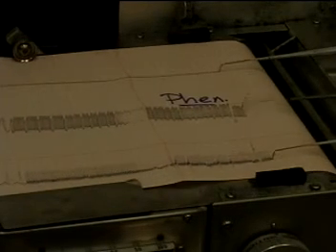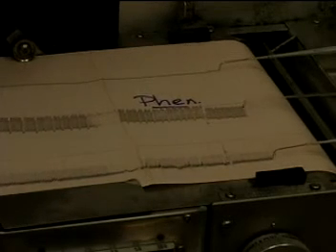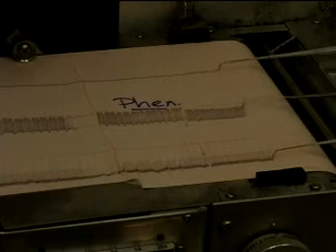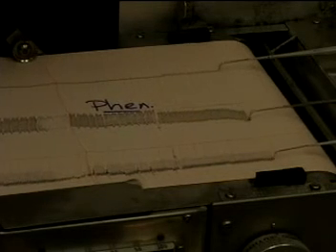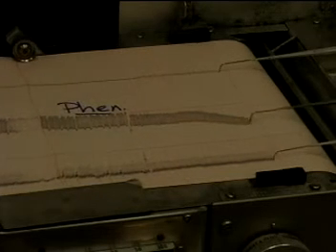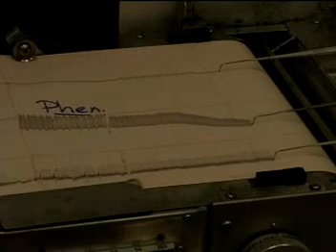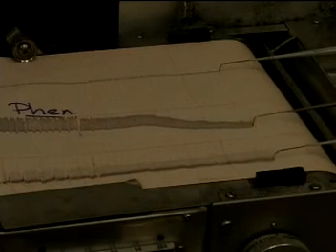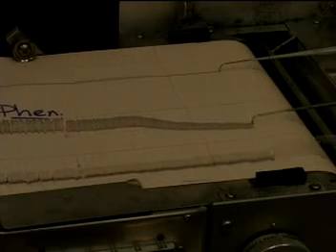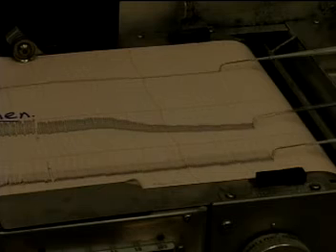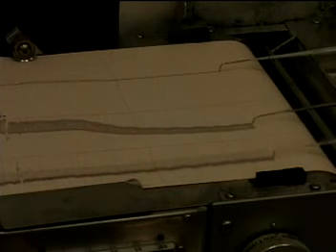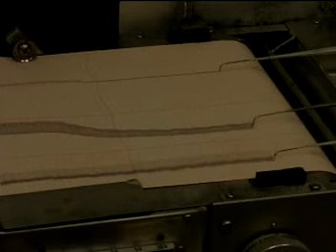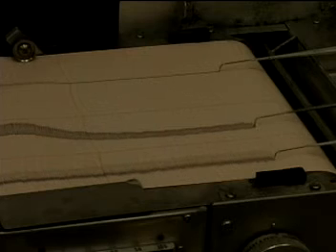We're now injecting phentolamine, the alpha receptor blocker. Because the sympathetic nervous system maintains a tonic vasoconstriction, an alpha blocker will actually cause a decrease in diastolic blood pressure because we've lost that tonic vascular tone. And you see here that the blood pressure waveform has decreased. This should not be affecting the beta receptors. We have blocked the alpha receptors, and the muscarinic receptors are still blocked but they don't play a role here.